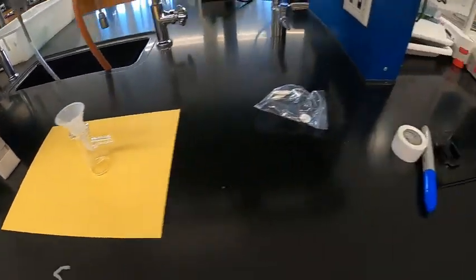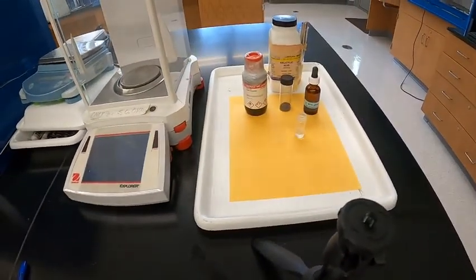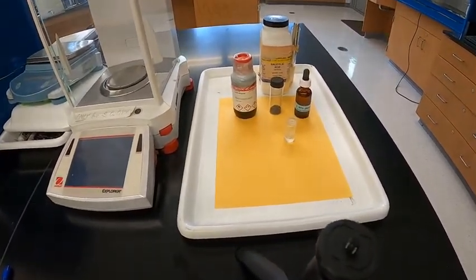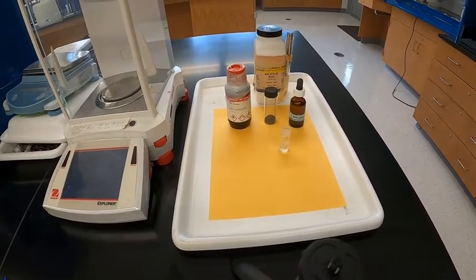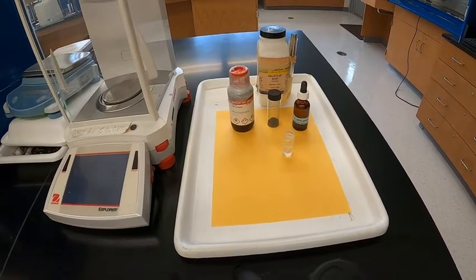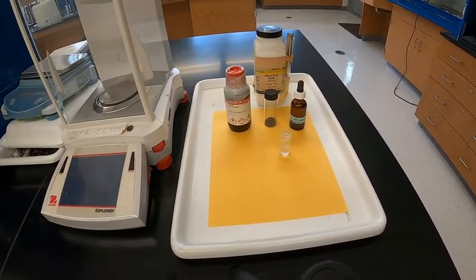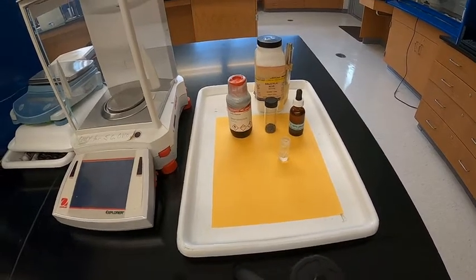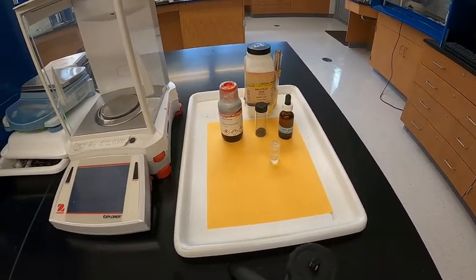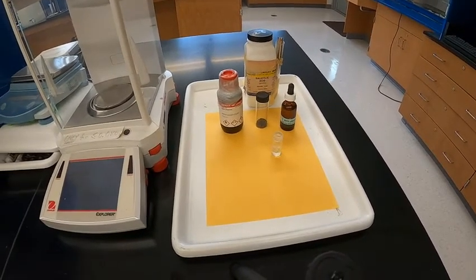When you're doing this lab at home with the video, you should make sure that you record all the masses of the reactants and later the masses of the products. This will include massing of the empty vial, the empty vial with a boiling chip, and the empty vial with the boiling chip and the salicylic acid, the primary reactant.